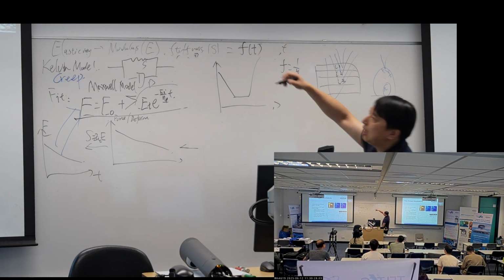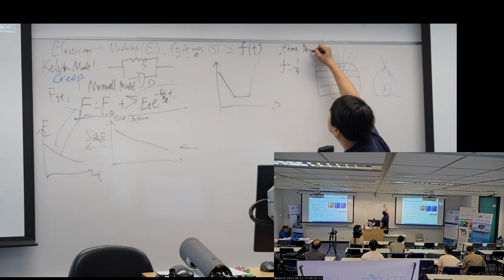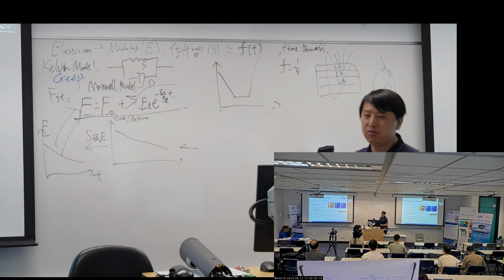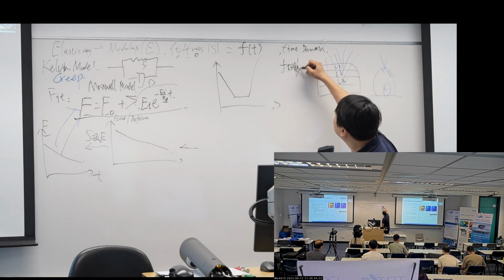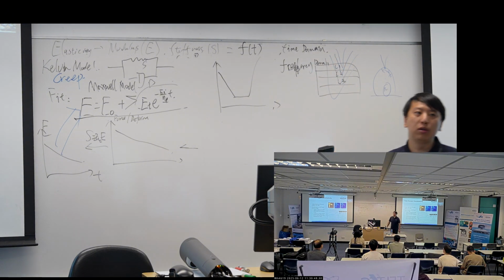We call this technology time domain. Time domain measurement is the creep and the relaxation. And for the frequency domain, they call their technique dynamic mechanical analysis, DMA.